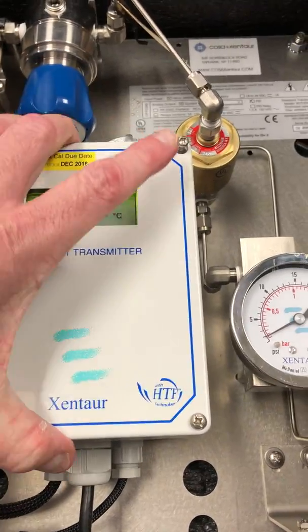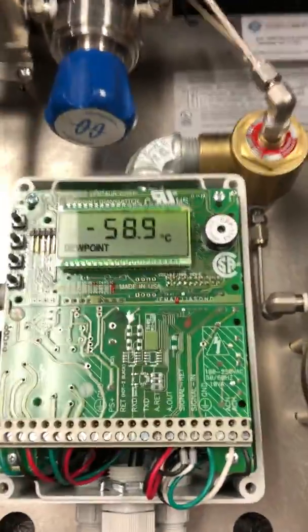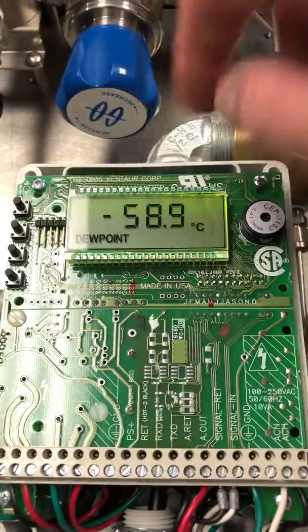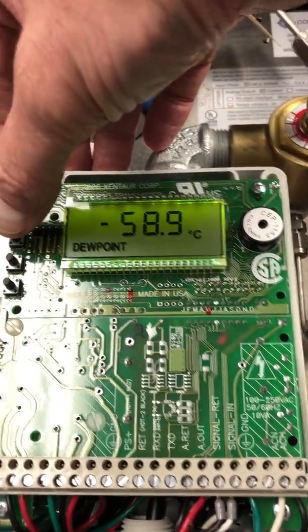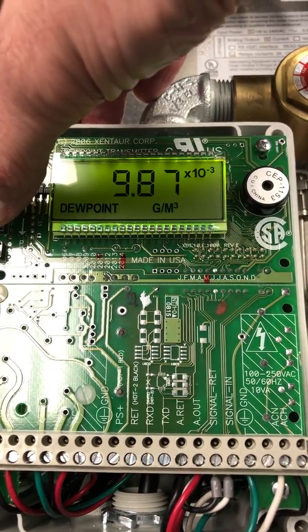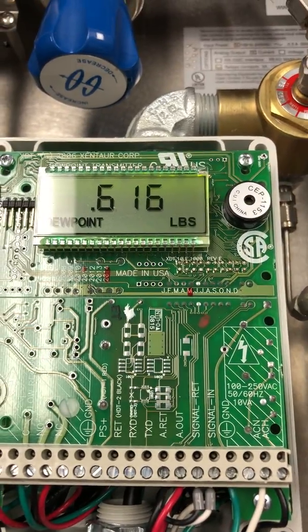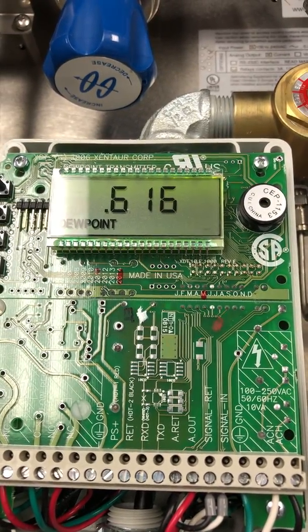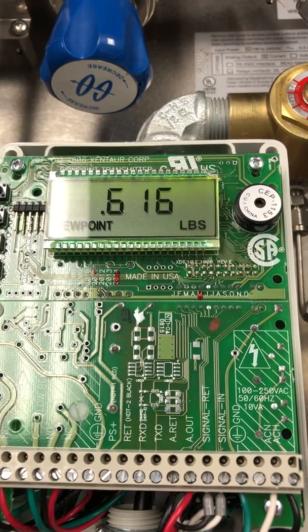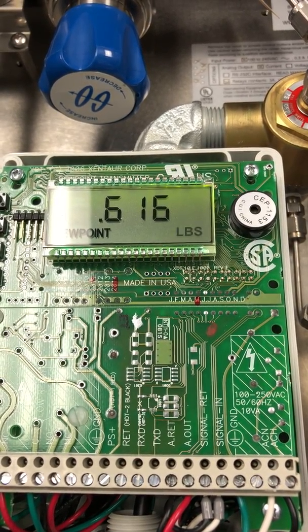If we want to change the units, you can see we're locked on degrees C and we want to change to something else — in this case, pounds. The pounds light is still flashing, which means it's going to switch back to its original units because it's locked. After that clears, we will change it.